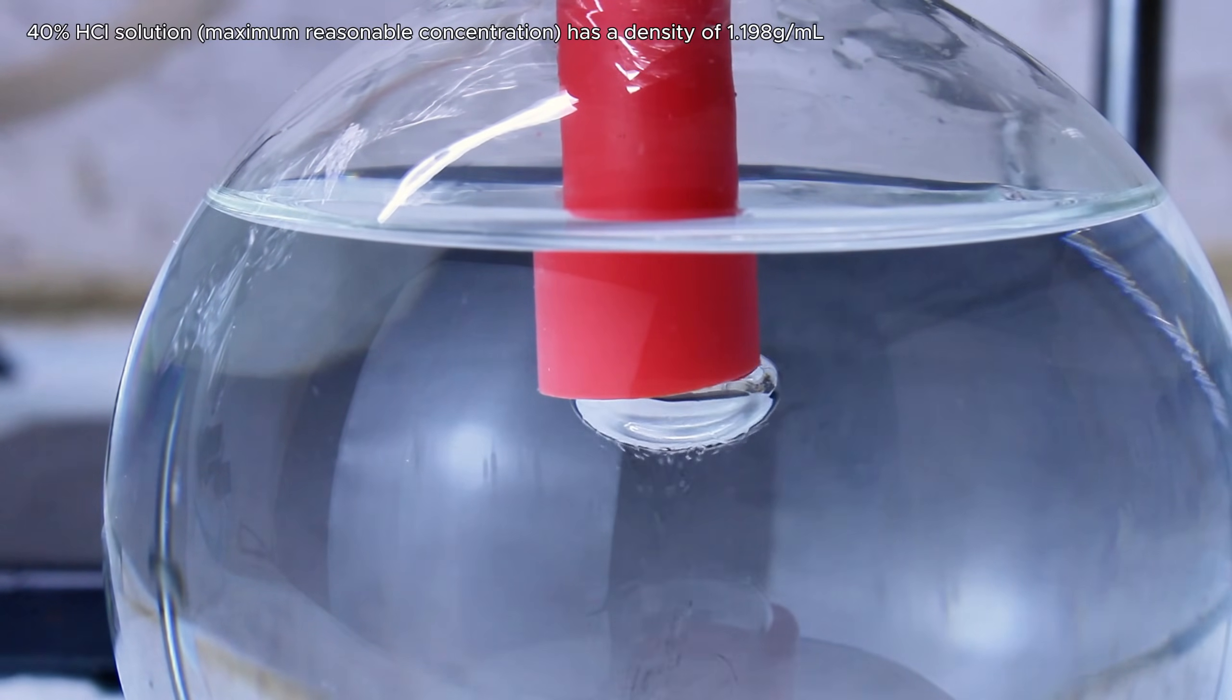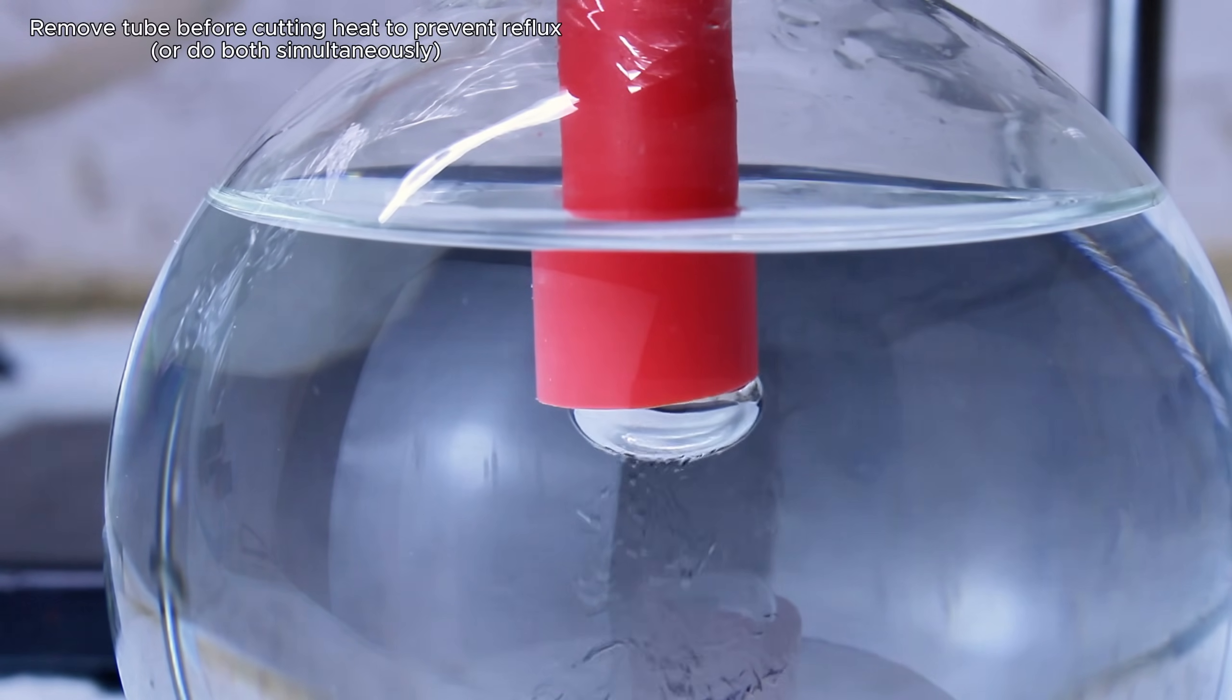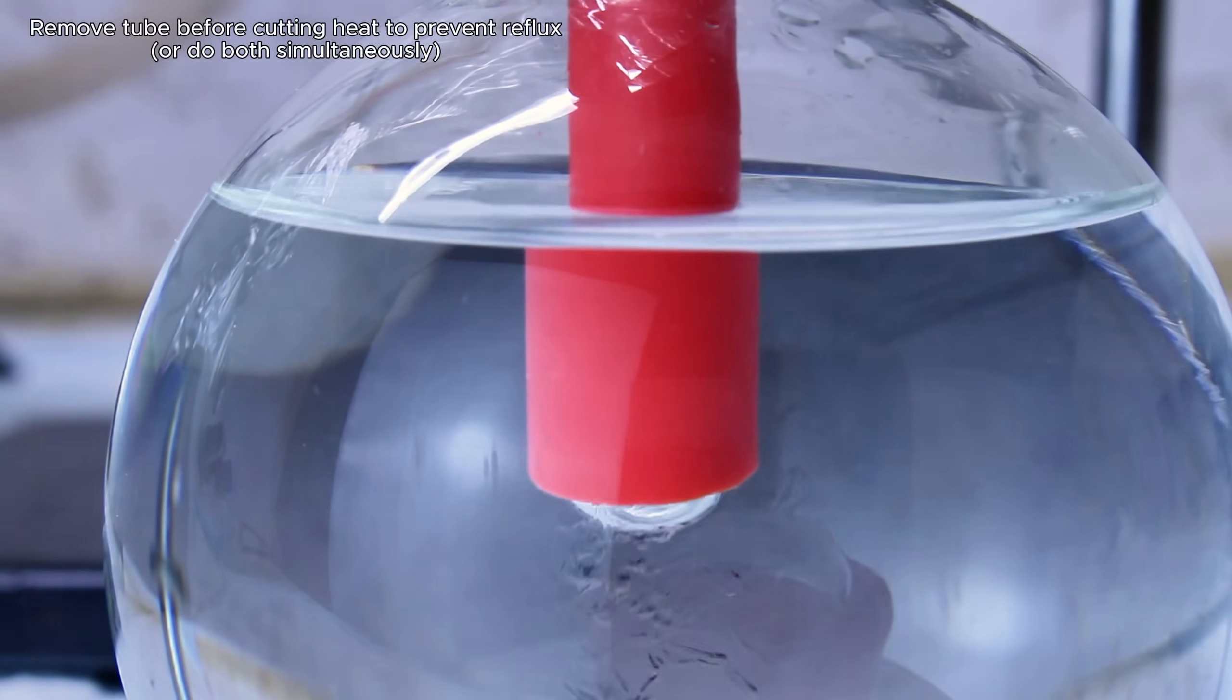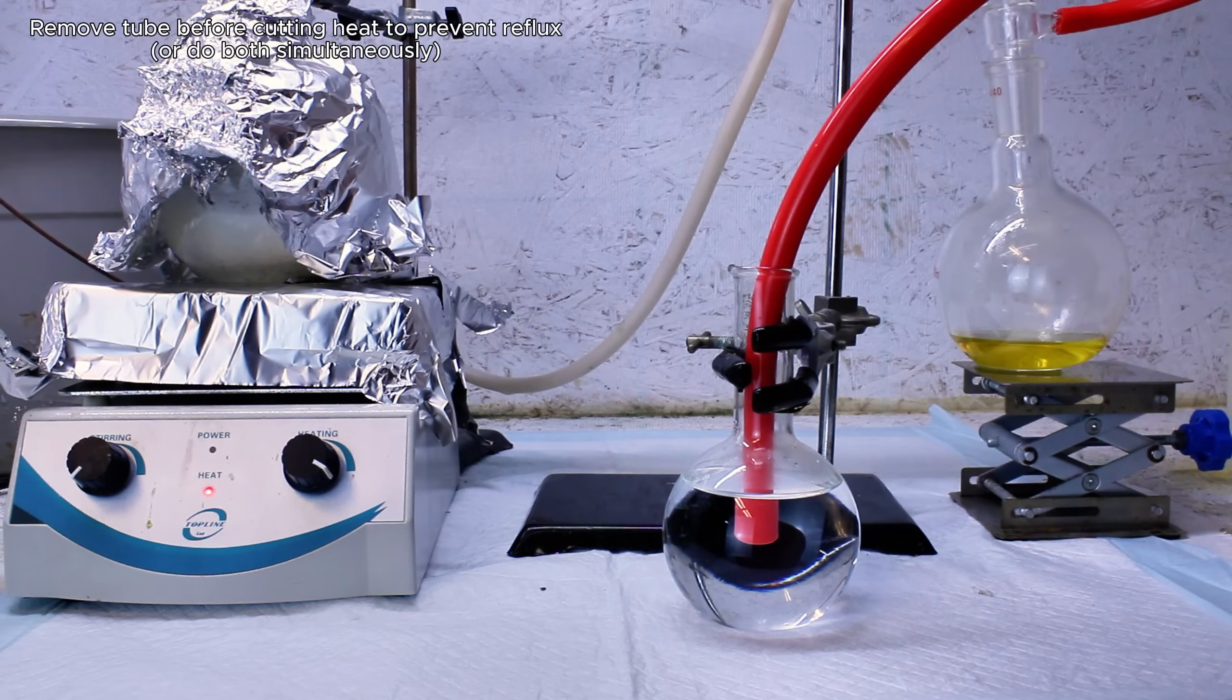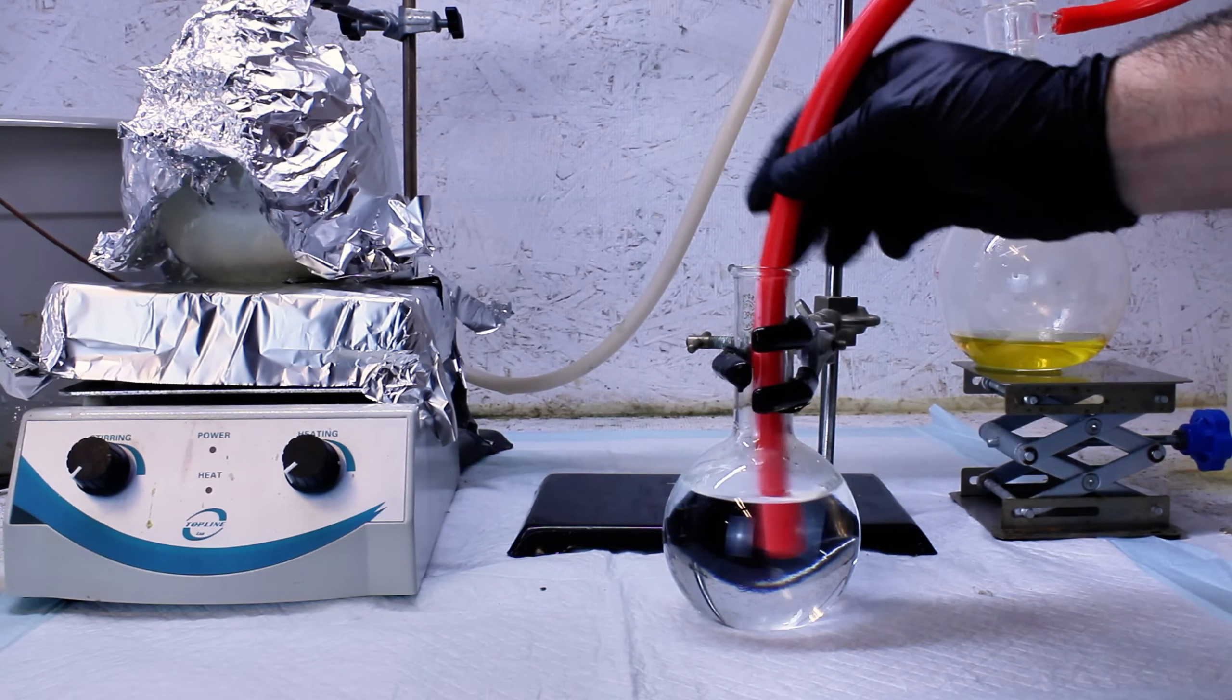Anyway, the progress of this reaction can be tracked by watching the dissolution of hydrogen chloride in water. Water saturated in hydrogen chloride is far denser than pure water, which results in the beautiful streaking effect you've been watching. Once this slows to a crawl or stops, the reaction is over, and you can cut the heat after making sure to remove the PVC tube from the acid.